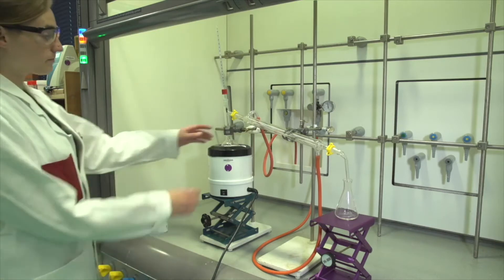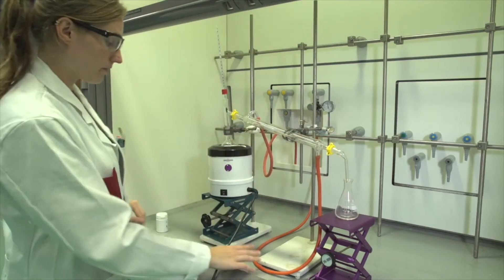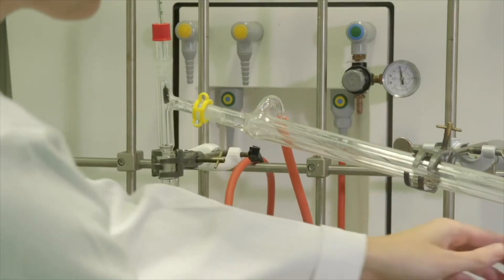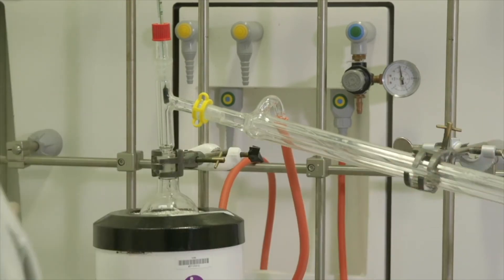Now examine the setup. When the support jack is lowered, the flask is not in contact with the heat source. This is important to remember if you want to cool the solution. In addition, make sure that your clamps are tight and that the tubing does not leak when you turn on the water.